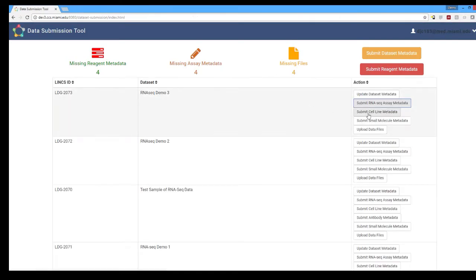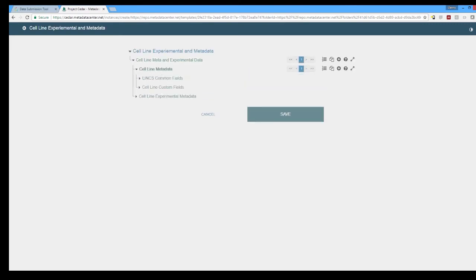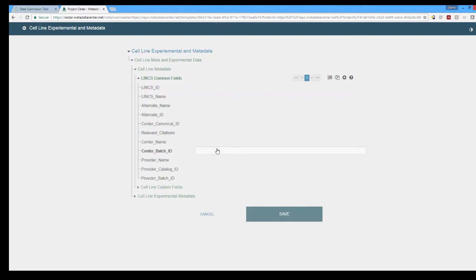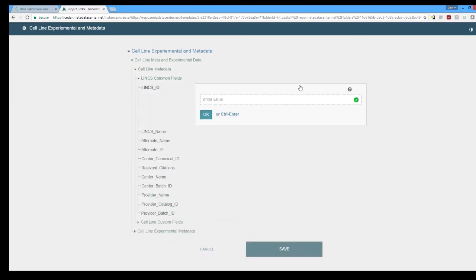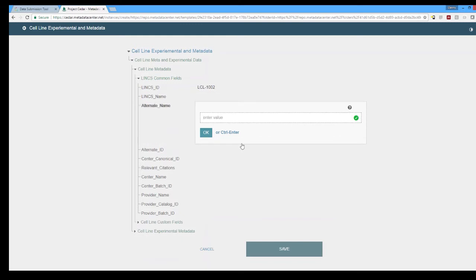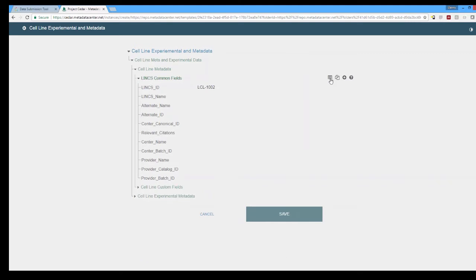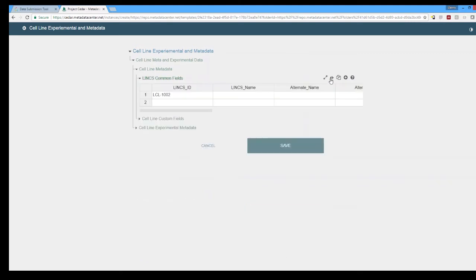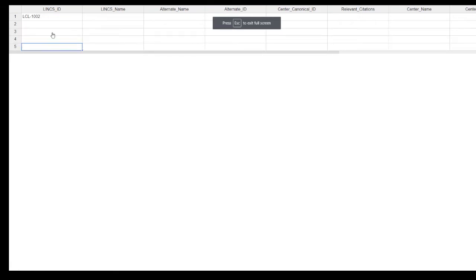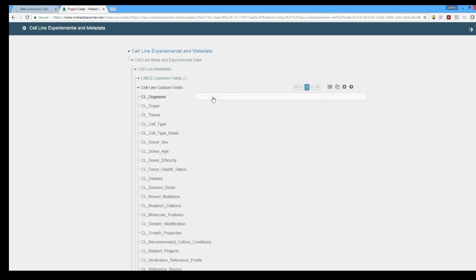Going to the cell line metadata you'll see several key features here. Under the cell line metadata category you'll see we have the Lynx common fields and the cell line custom fields. The Lynx common fields are so called because they are in every single type of reagent metadata that we have whether it's a cell line, a small molecule, a protein, antibody, or anything else that's used. They will always be the same and these are primarily identifiers and canonical names that are utilized for these particular reagents. We can also change this to a spreadsheet view so that we're able to copy and paste directly from something like an Excel spreadsheet so you can have multiple entries simultaneously again looking at ease of use for the user.